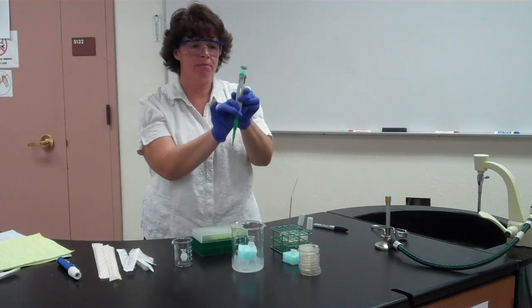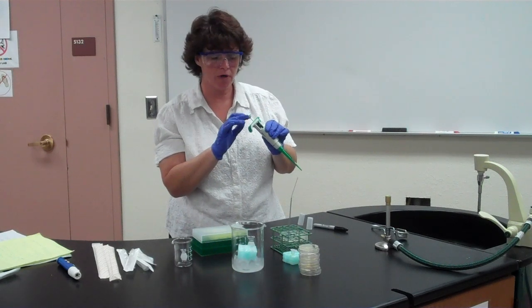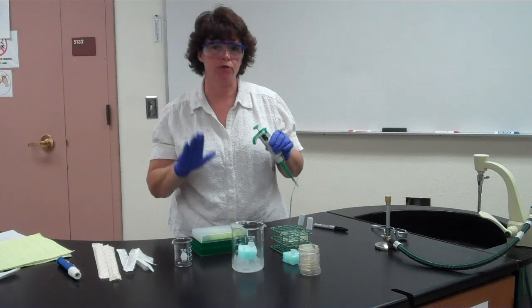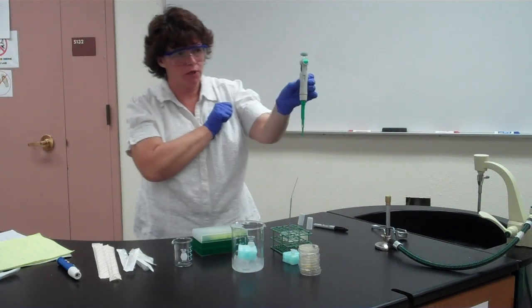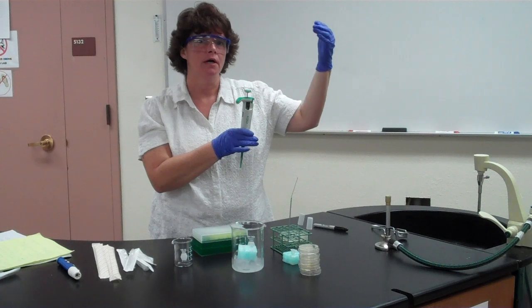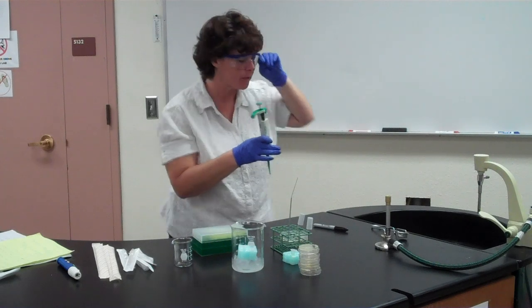Now we're going to use these micropipetters. Our pipetters go from 2 to 20 microliters. The 2 is the lowest that can go, and 20 is the highest it can go. Never go past 20, so don't go to 21. Never go below 2, don't go to 1.9. On this, you'll see there's a window, and there's 2 black numbers and a red number. Okay, the black numbers represent the numbers in front of the decimal point. The red number represents a number after the decimal point.